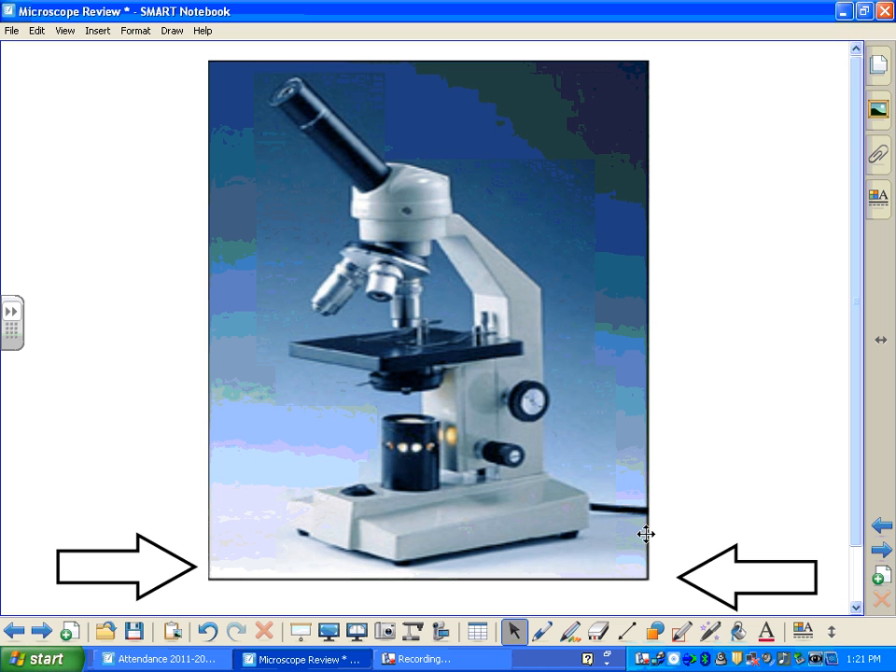Moving to the right side of our diagram, starting up at the top, we've got the arm — this is one of the areas where you hold the microscope when you're carrying it. Below that is the coarse adjustment knob, which is used to raise and lower your stage quickly. Below that is your fine focus knob, or fine adjustment knob — this also moves your stage, but very slowly. And finally you have the base of your microscope, which is the other location you carry your microscope from.